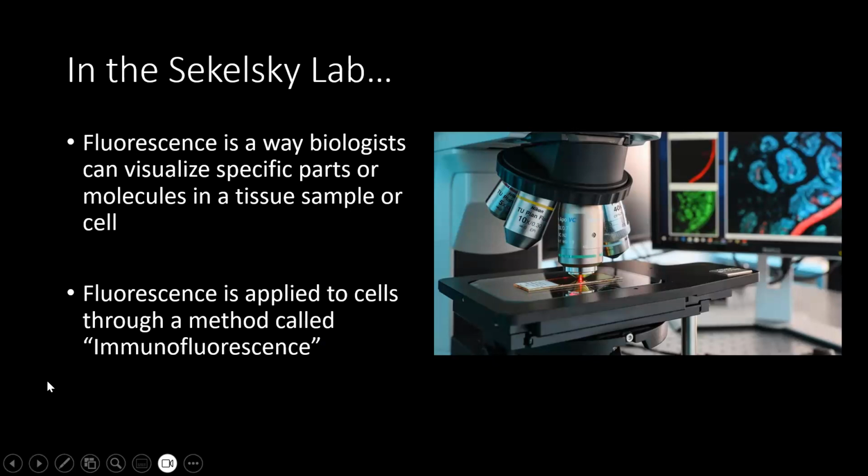So in the Sikelski lab, fluorescence is a way biologists can visualize specific parts or molecules in a tissue sample or cell. And it's applied to cells through the method I'll be talking about today, immunofluorescence.